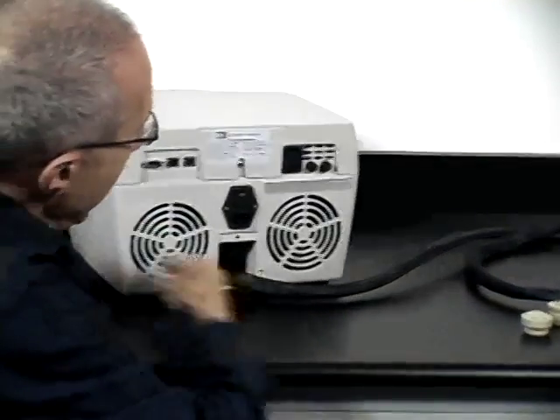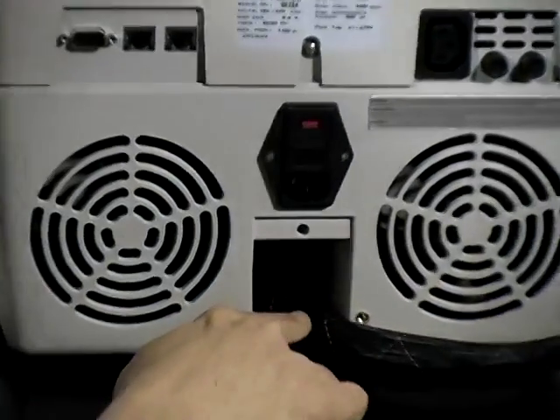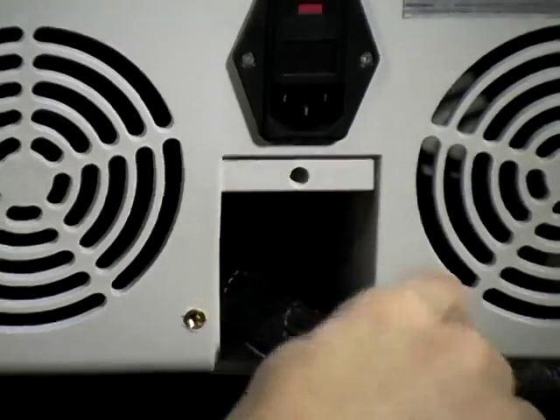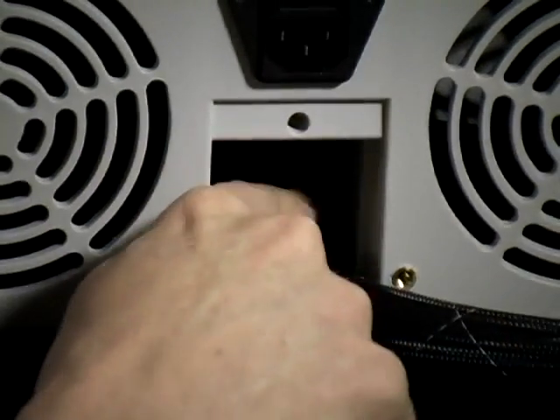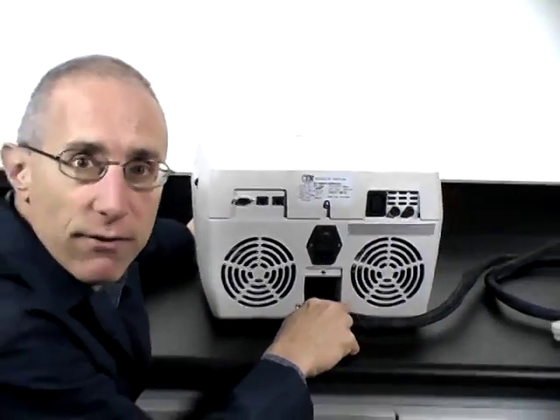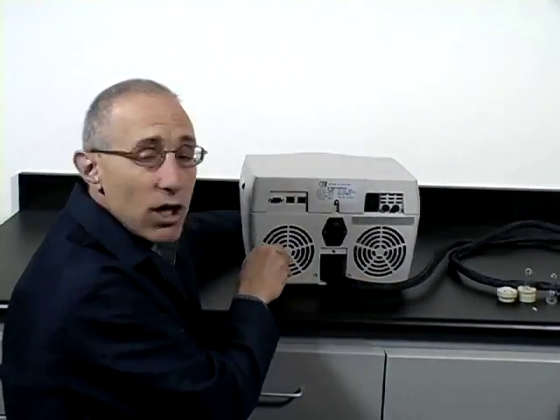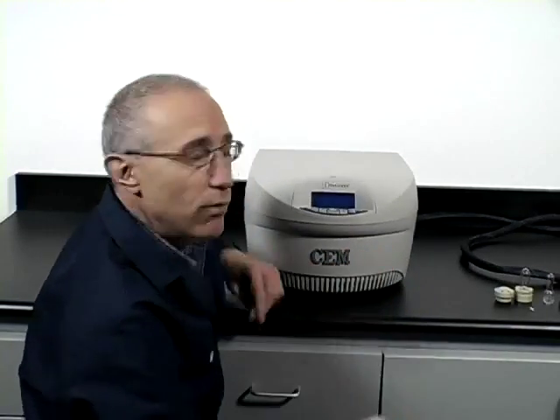I want to show where the cable bundle comes out of the system. It comes out of the back side of the generator controller, and it's actually a bundle — there are four lines coming out of here: the main microwave transmission line, and then the connections for the stirring feature, temperature feature, and the gas cooling feature. That covers the remote generator controller.